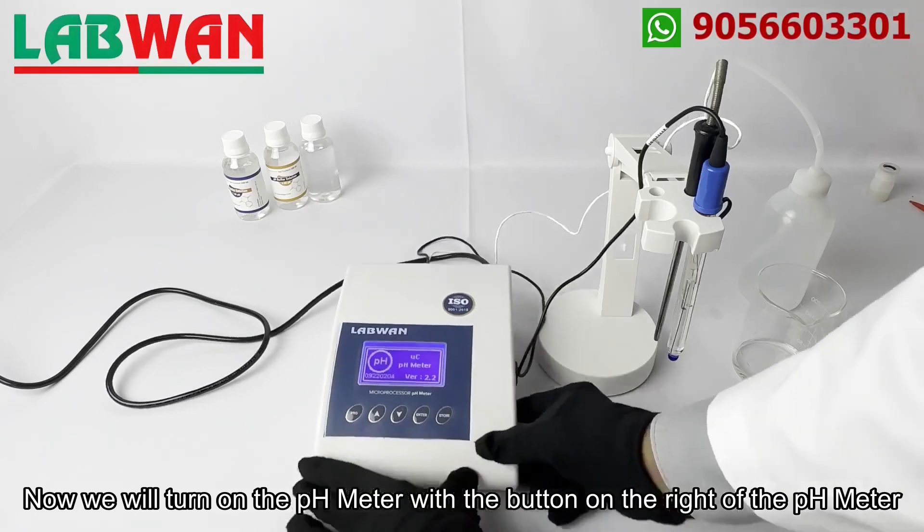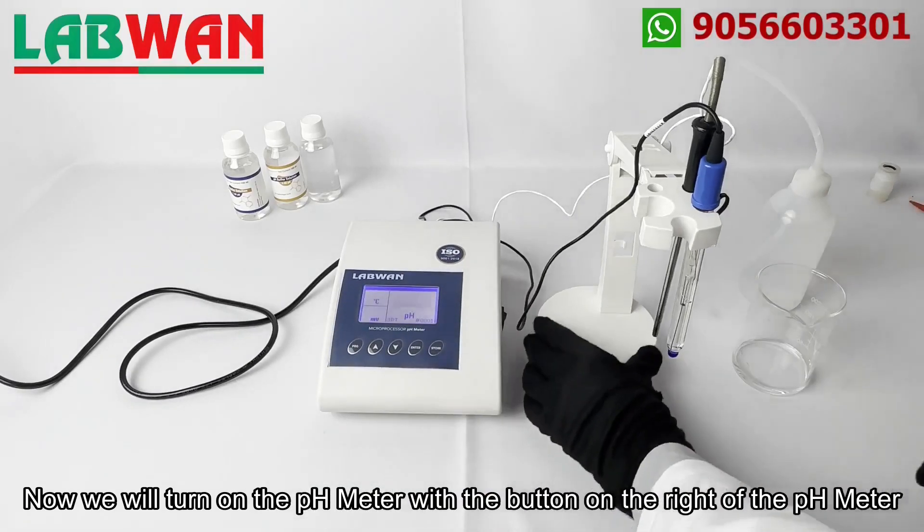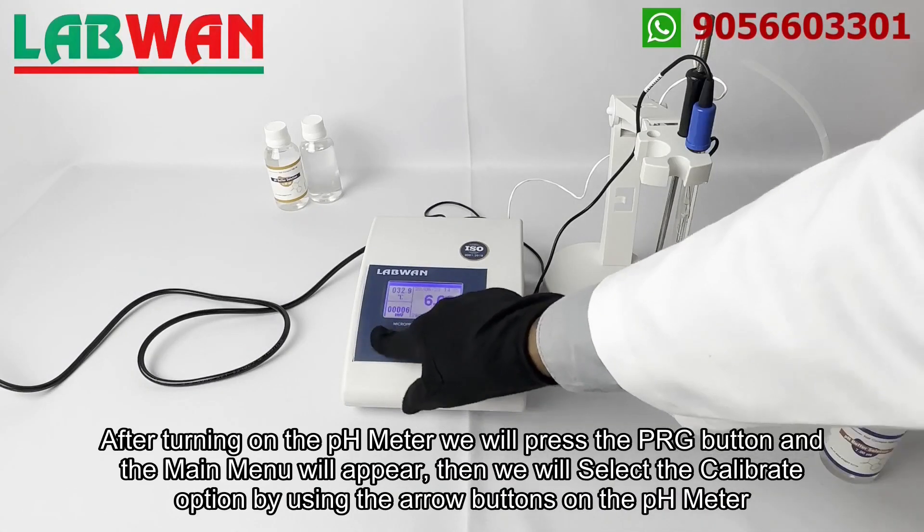Now we will turn on the pH meter with the button on the right of the pH meter. After turning on the pH meter we will press the PRG button and the main menu will appear.